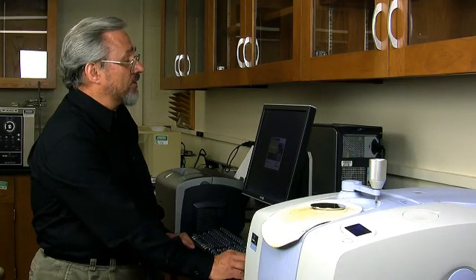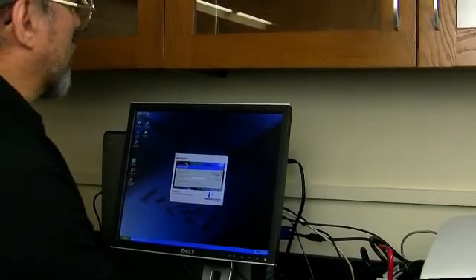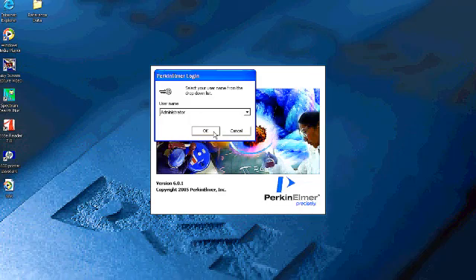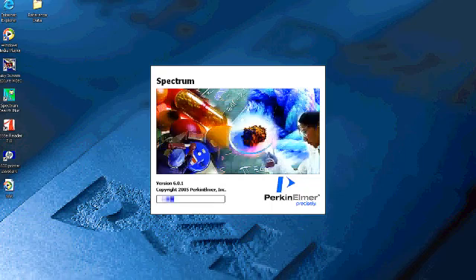We're confronted with a login screen, which we say OK, and then another Spectrum login icon, which we click OK to, and then we simply wait for the instrument to warm up.